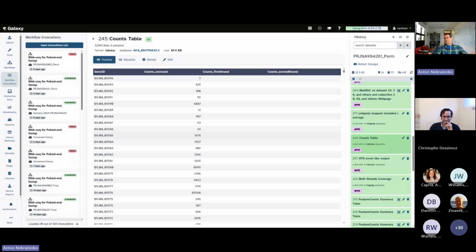Again, it's a half-an-hour webinar, but we're going to have a white paper describing precisely this analysis published. It will be on the BRC site sometime next week, so you can read in detail what I'm talking about. But these kinds of investigative actions, given the paper, its supplementary data and the SRA IDs, figure out what is what, are perfect for agentic AI.